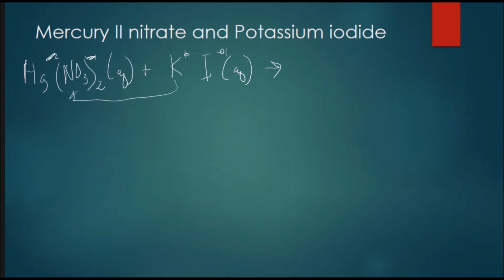Well, it's not going to be potassium anything. Folks, get it through your heads. Potassium, sodium, lithium, cesium. It's just potassium and sodium. If you can just remember potassium and sodium, it's going to give you such an advantage. No, they are aqueous, so it must be mercury and iodide, and you're going to need 2 iodides. And that's a solid. It was that orange crystal.